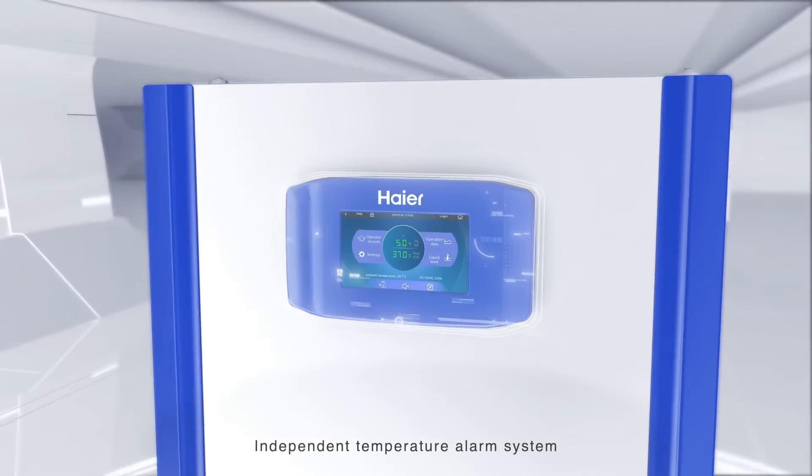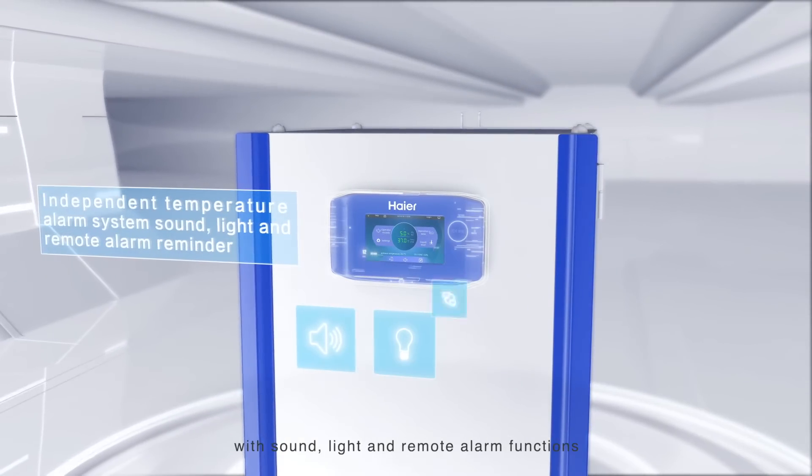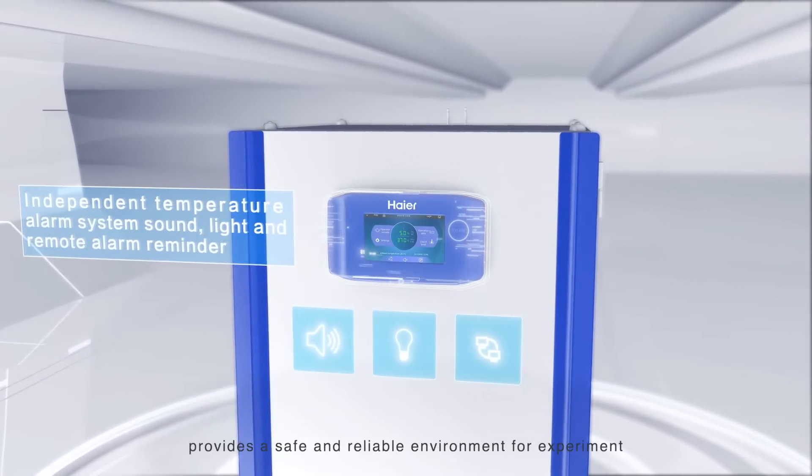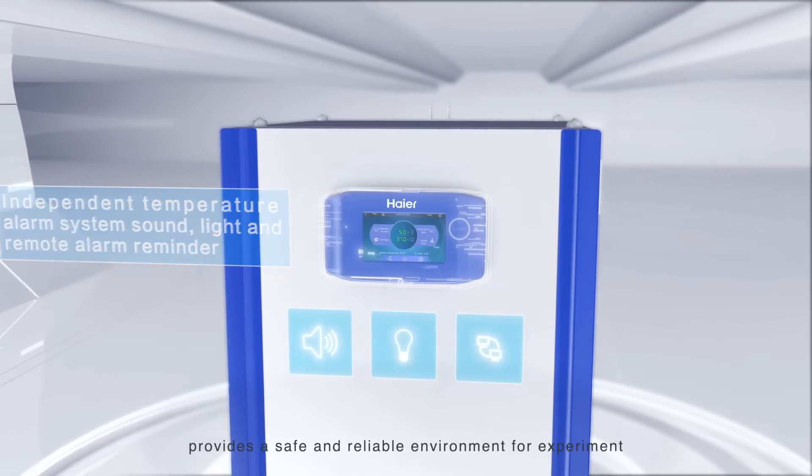Independent temperature alarm system with sound, light, and remote alarm functions provides a safe and reliable environment for experiment.